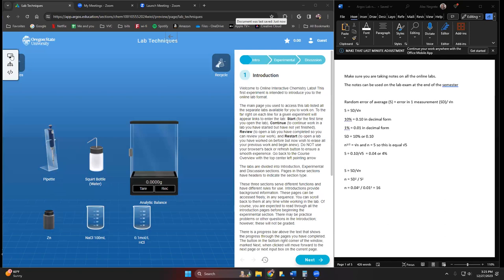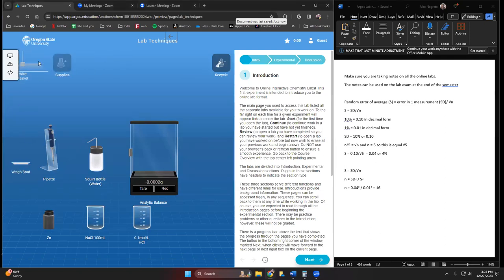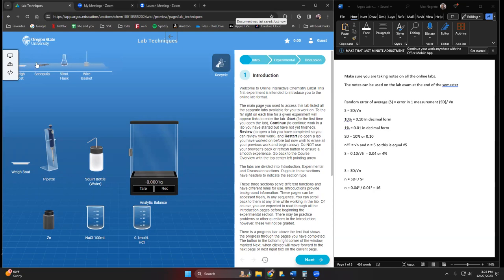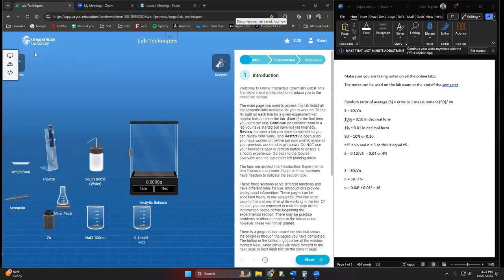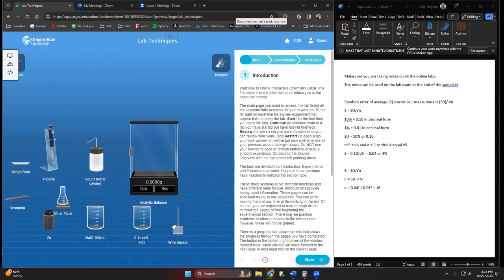You're not going to have this tab right here, but under this plus sign is where you can get your other supplies. I'm going to bring a few of these down here. You just grab them and bring them down, and they're also named as well.